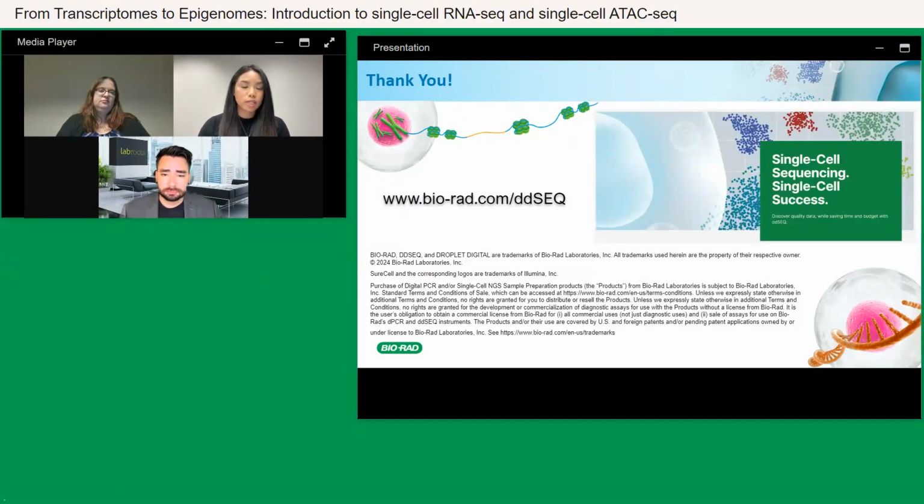If you need 60,000 cells or nuclei at the tagmentation step, you want to make sure you have enough in the upstream process, so that not only do you have enough cells, but you're also seeing a pellet. It also depends on whether you are a first-time user or an experienced user. That can vary in any process or treatment that you do. You are expecting some cell loss, so keep that in mind.